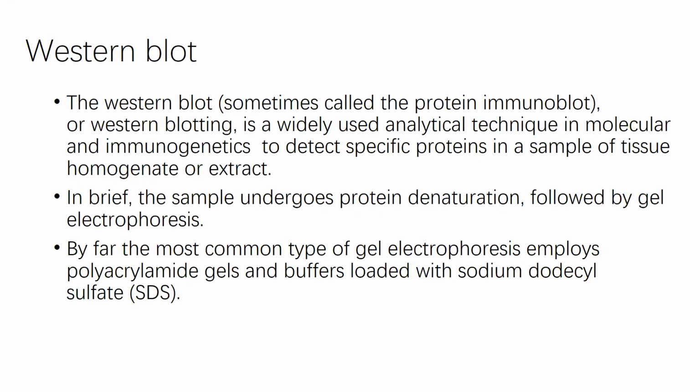This method detects specific proteins in samples of tissue homogenate or cell lysate extracts. In brief, the sample will undergo protein denaturation followed by gel electrophoresis.